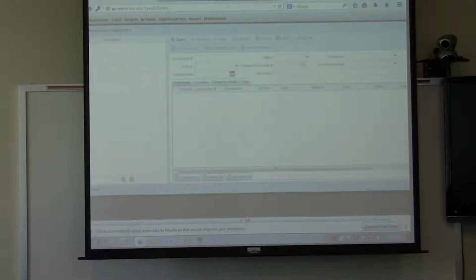Oh, wonderful, small screens. So here you see you don't get the initial pop-up, because we've redone the screen to be more consistent with the other screens. So it's got the standard query features on it with the left bar. You'll notice a couple new features: there's this slider over here as opposed to the shade thing that pops in and out, so you can resize that and give you a little more room.